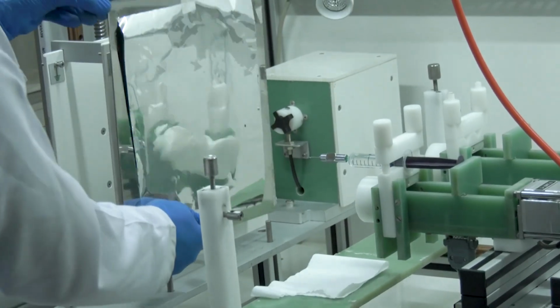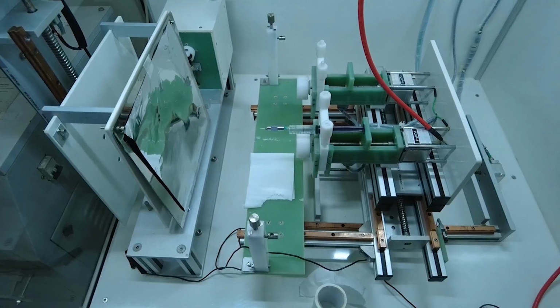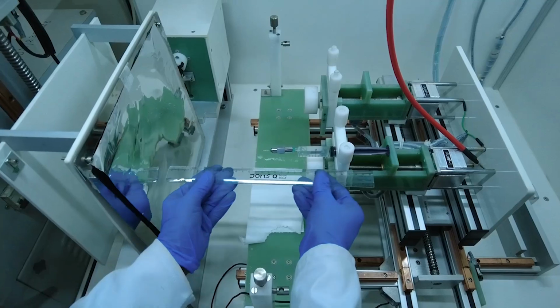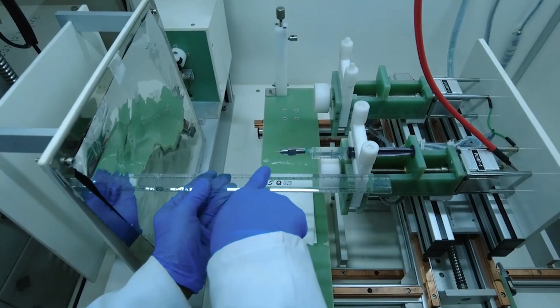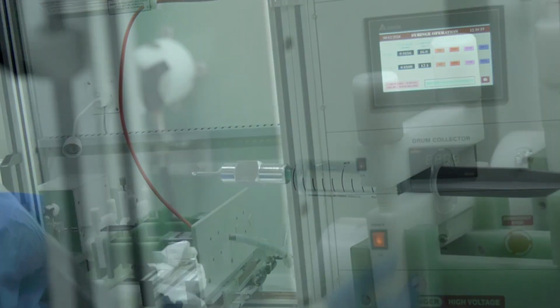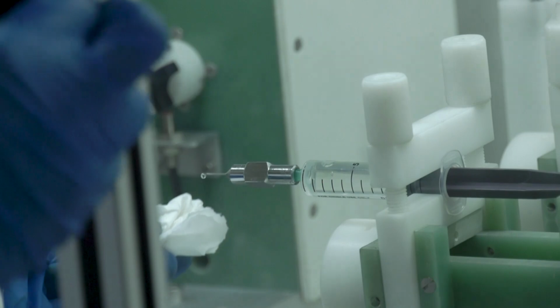Then place the collector. Adjust the distance between the syringe and the collector. Once the distance is set, move the syringe pump forward to ensure that the polymer is coming out of the syringe. Use tissue paper to collect any excess polymer.